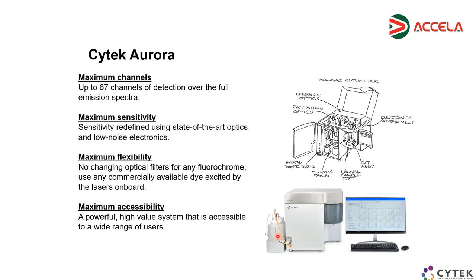About the FMO, as you know, there is no universal rule. Some people use it depending on the complexity of the panel and the type of marker you are using. For my information, there was no use of the FMO in this 23 color panel. But I can get some more information about this for you if you like. Absolutely, we are very interested.